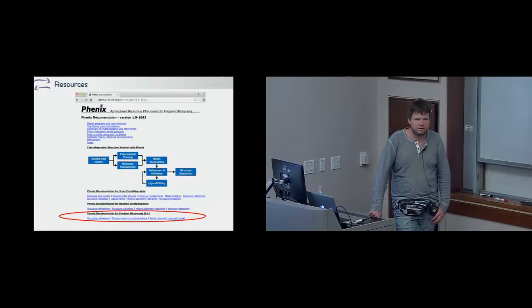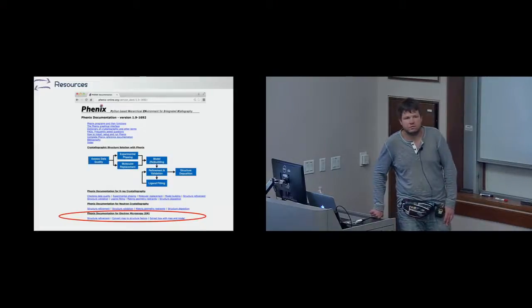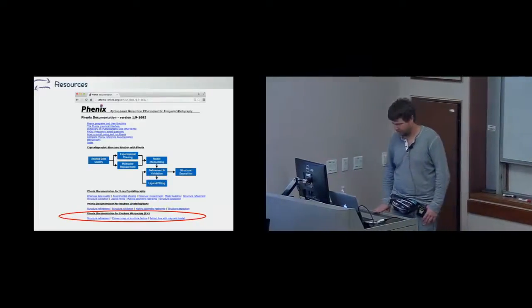And the second future direction that we are kind of brainstorming right now is I'd like to apply density modification techniques to CryoEM maps. This is something going to be very new, and again, we have ideas how to do it. We just need to try and see how it works. Of course, it will not work from the beginning, but we hope it will eventually.